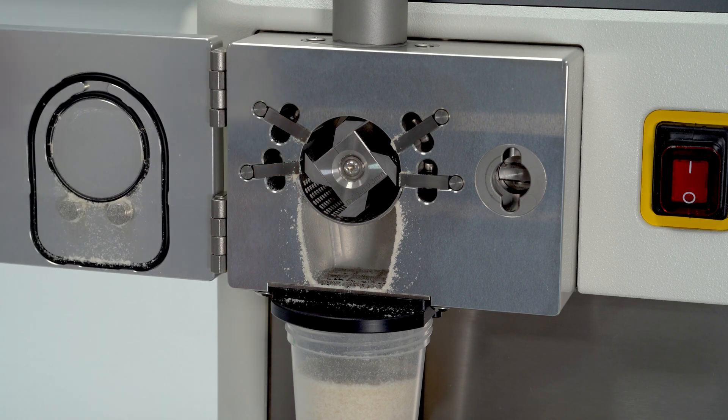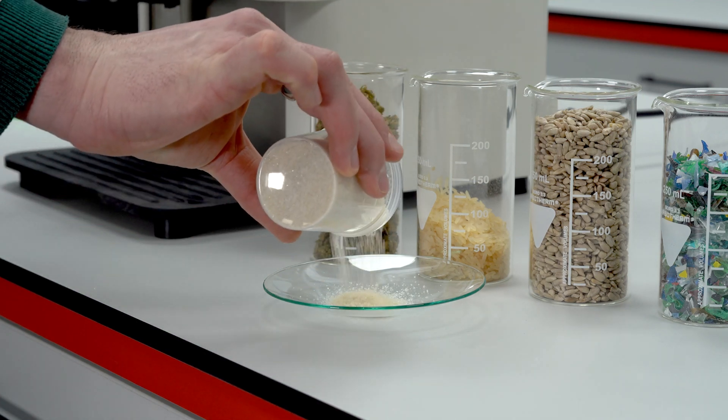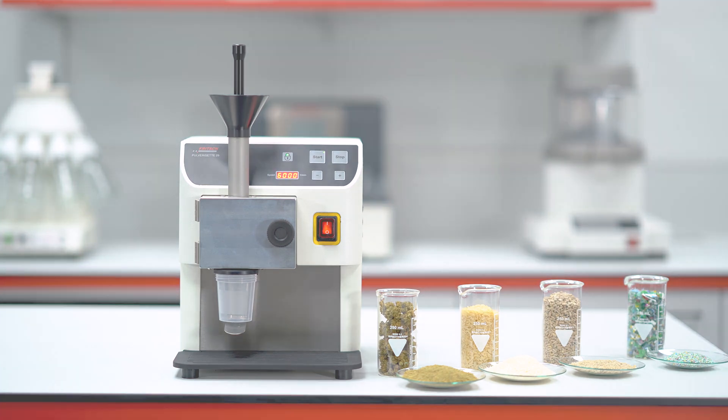Due to the advanced cutting geometry, the sample material is automatically transported and increasingly finely comminuted by shearing forces between the knives until the desired final fineness is achieved. Fritsch P29 — the small professional grinder for versatile use.